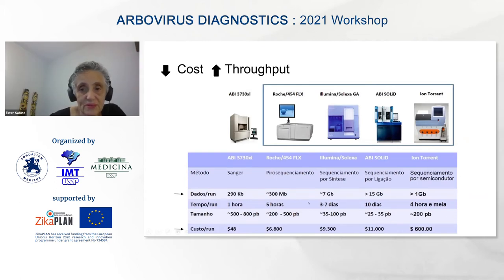This slide is a little bit old in terms of what they do, but in general, especially Roche 454 is no longer being used. And there are also updates. Also the AB SOLiD is starting to be discontinued, and you have this Ion Torrent and then our other versions that do more sequences with a higher input. So these are the ones that are now being used more frequently from this generation of devices.